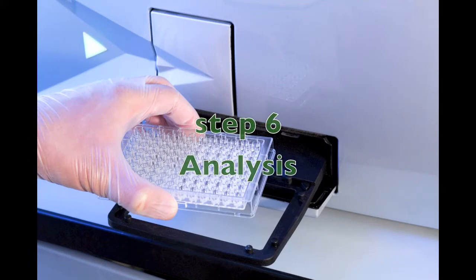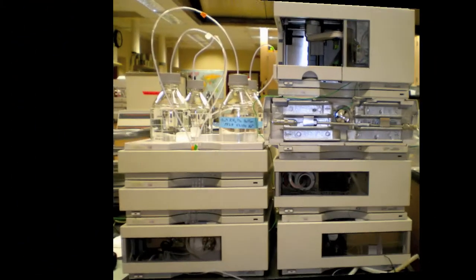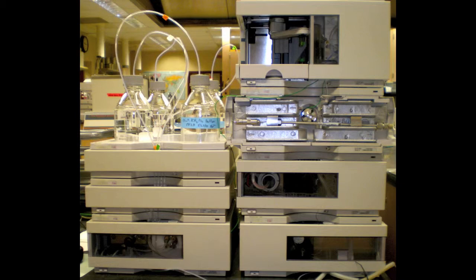Samples can be analyzed by UV plate reader or by HPLC.